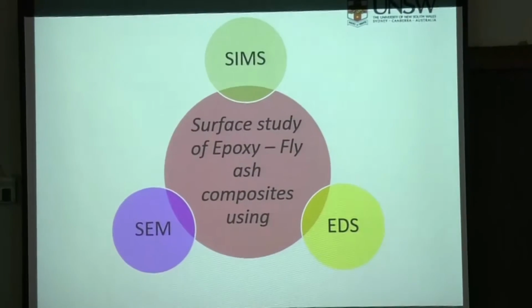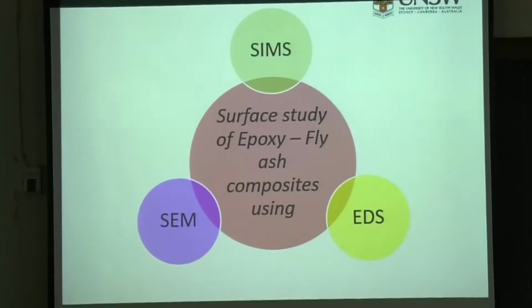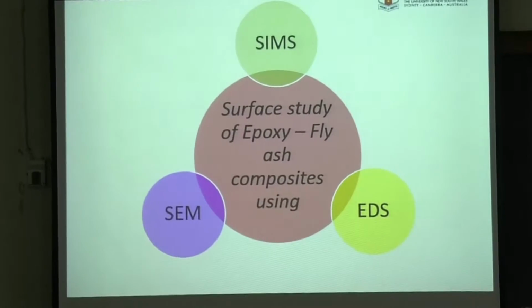Surface identification and also looking at the surface distribution of composites. And the techniques used have been SIMS, SEM, and EDS.